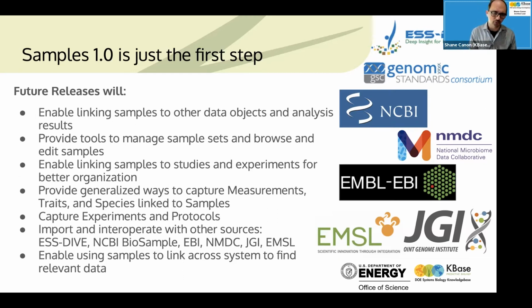We know this is important for a lot of use cases, so we're working through some of the design elements for that as well. And eventually being able to even capture experiments and protocols so that those can be captured in the analysis, as well as just provide additional context for the samples.